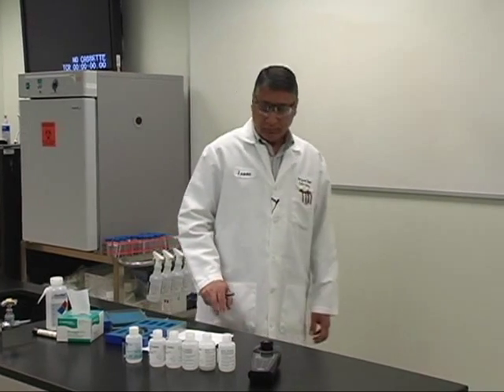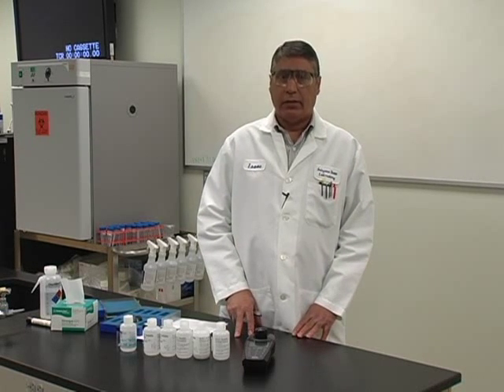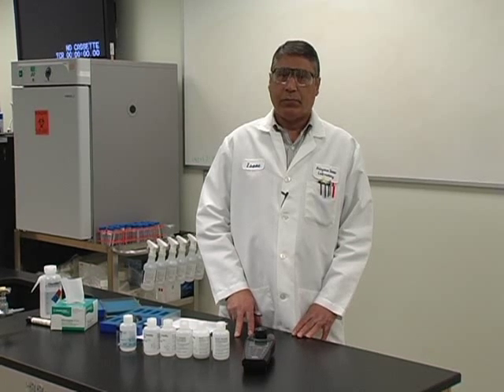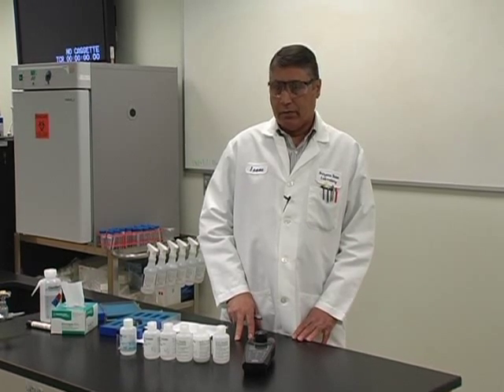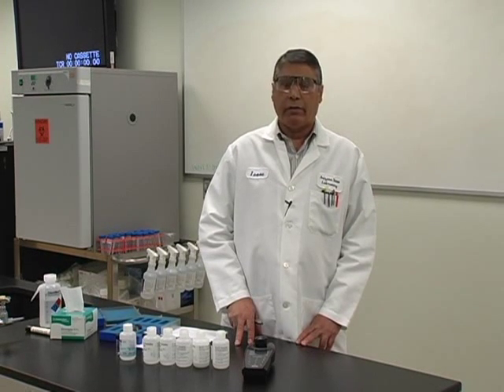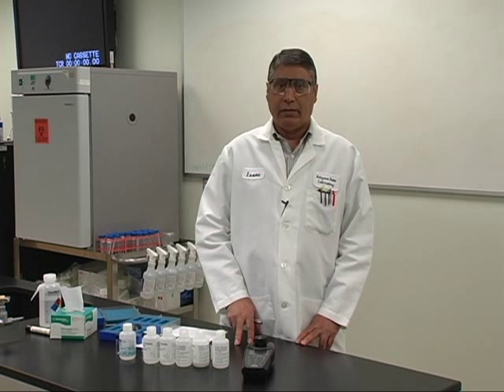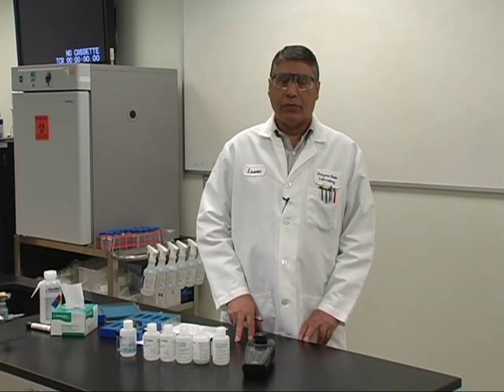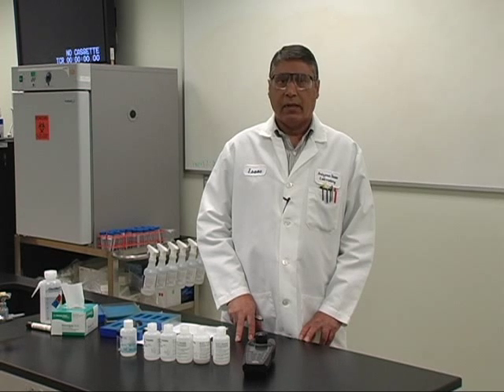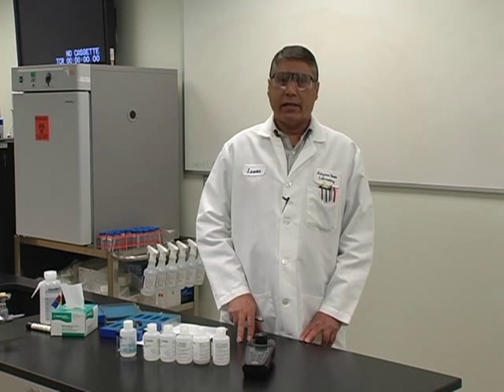The easiest ADHS approved method to do turbidity, which is approved for compliance purposes, is standard method 2130B. This method is very similar to EPA method 180.1, except that standard method 2130B does not require a linear calibration range study initially and semi-annually, and does not require a second source calibration check every quarter.